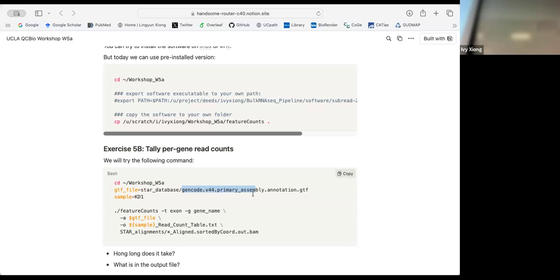Yeah, they're always the same thing. So this is just an example. I believe that would be the case. Yeah, that would be... and it's truncated, so I don't know. Is there some sort of percentage we give them before?